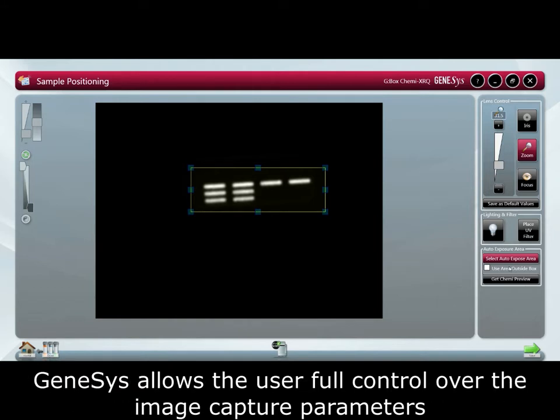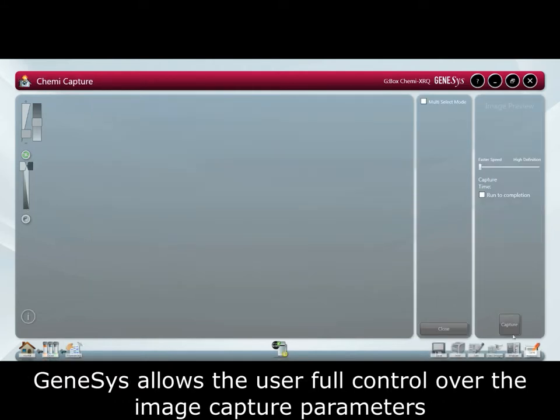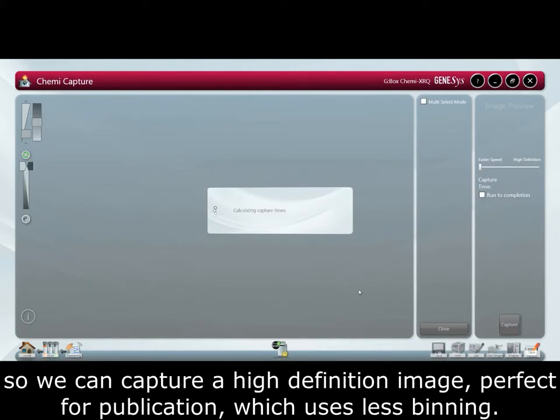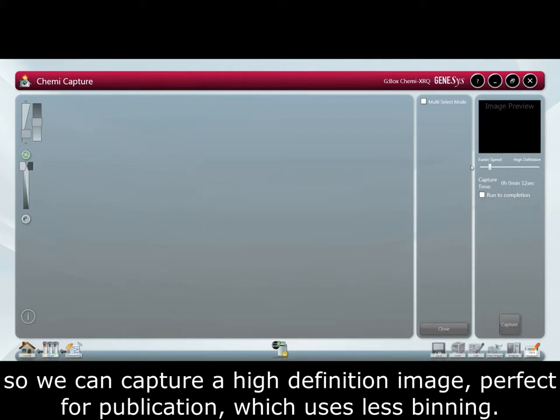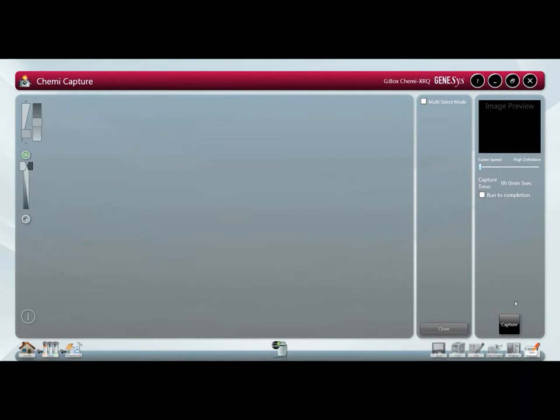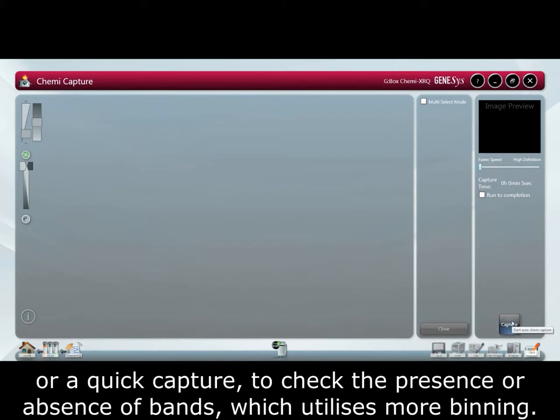Genesis allows the user full control over the image capture parameters so we can capture a high definition image, perfect for publication which uses less binning or a quick capture to check the presence or absence of bands which utilizes more binning.